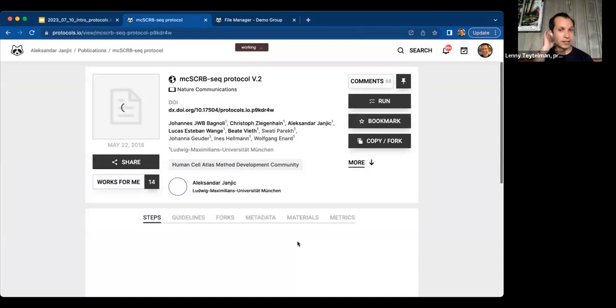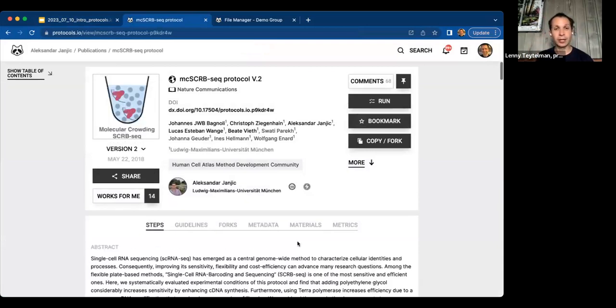those 14,000 public protocols that we have, but it's important to note that when you're on protocols.io, every protocol you create by default is secure and private. It's yours. You decide who to share it with, whether to share it at all, and if you share it with anyone, what access permissions to give them: viewing only, or viewing and editing, or full collaborator who can publish and is a co-author. But you decide who and when to share it with.